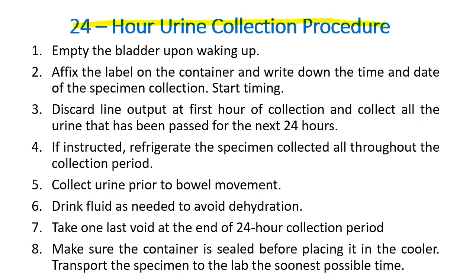Ito yung 24-hour urine collection procedure. Ang unang ginagawa, i-empty mo the bladder upon waking up. So yung pinakauna mong ihi sa umaga, hindi mo yun isasama. Bakit? Kasi yun pa yung, kumbaga, natira mong ihi nung nakaraang araw. So magsisimula ka dun sa pinaka unang ihi mo para sa araw na yun.